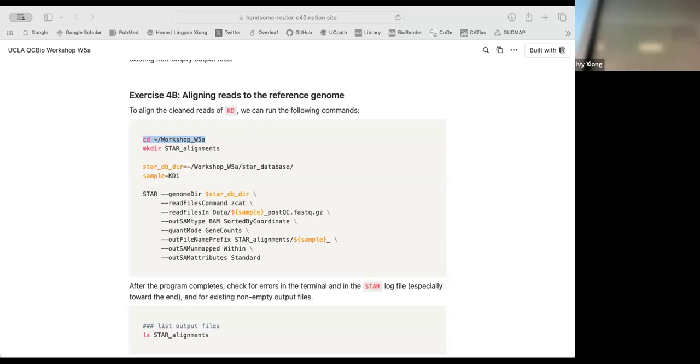I heard there is an error. Maybe you unzipped it or something.